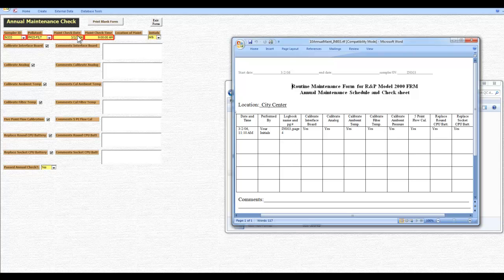So it's important, again, you must enter the information that is in the fields with the red border and that are in yellow. The fields that are in the red border are really hard to change afterwards because those are key fields. So these fields link the different data in the different forms, which go in different tables.